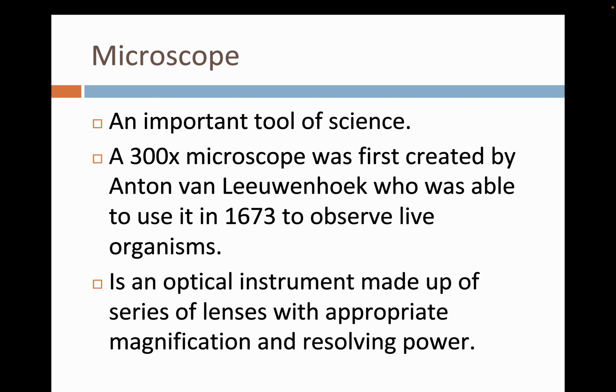And the intention was for him to be able to observe living organisms. Put simply, a microscope is an optical instrument made up of a set of lenses that work together in order to achieve a certain magnification through a specific resolving power.